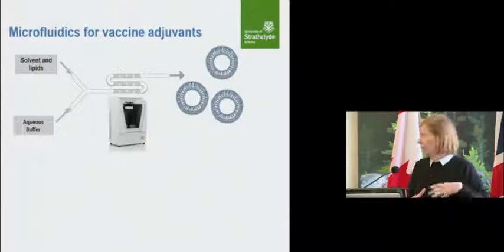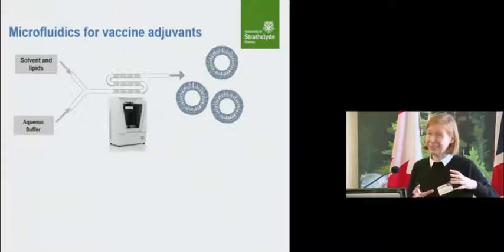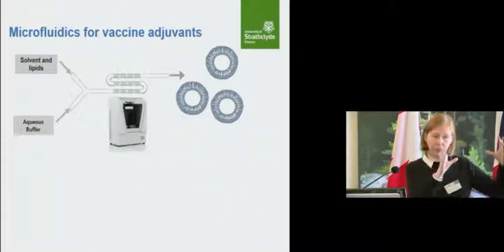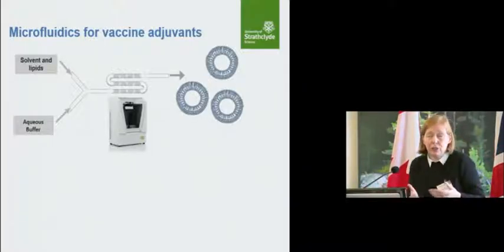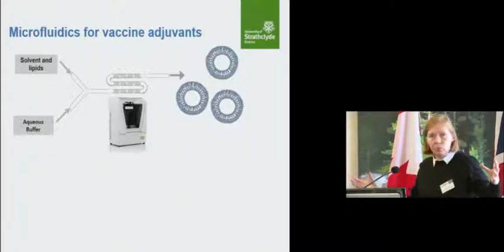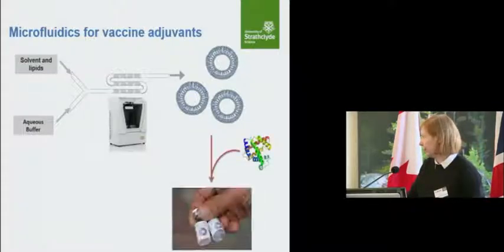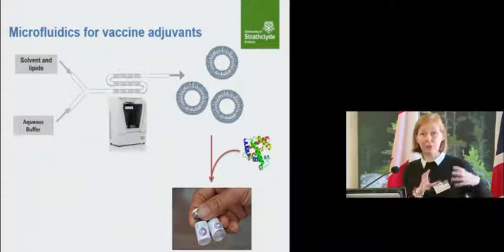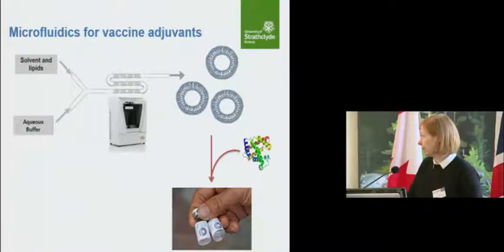So the idea was, we put our solvents in a lipid in one, we just go with aqueous buffer. Now, we are not putting the antigen in at this stage because the idea is we want something modular, we can produce our adjuvant on one site, potentially our antigen at a different site, so basically shorten the production period because you can have them both running simultaneously and then combine them when you're ready to go. So it's all about trying to make it quick, cost-effective. We would add the antigen, and that's the formulation. And the idea is you could also have these liposomes sitting ready to go, and then you just add whatever antigen you're looking for at that moment.